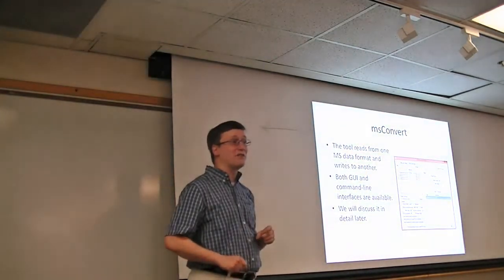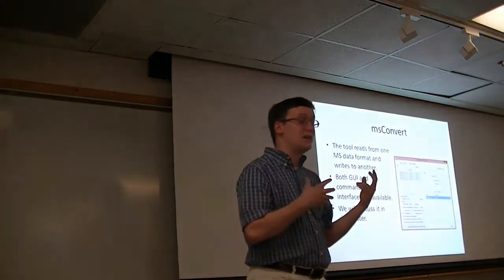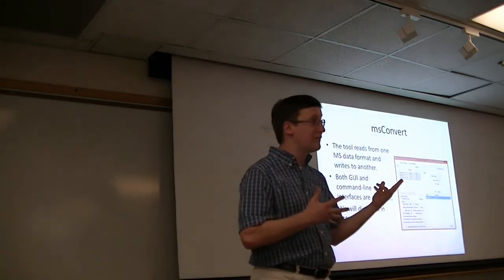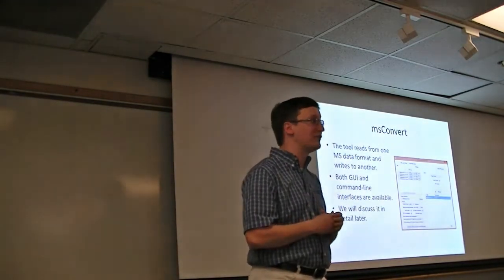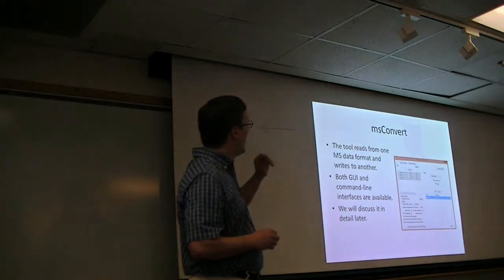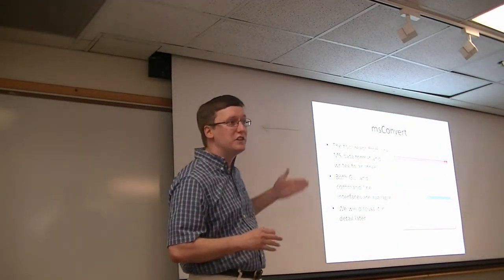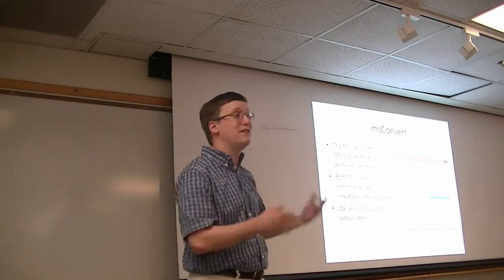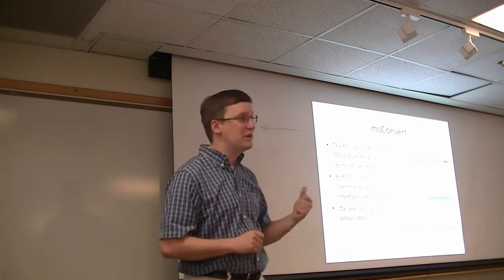We also have a graphical user interface. This is one of these things where I mentioned Jay Holman is somebody that I wanted to make reference to. Jay is the fellow who wrote the graphical user interface for MSConvert. So having the ability to queue up a block of files that all need to be converted in the same way, to apply filters to them and so on, these are the roles that we have in MSConvert.